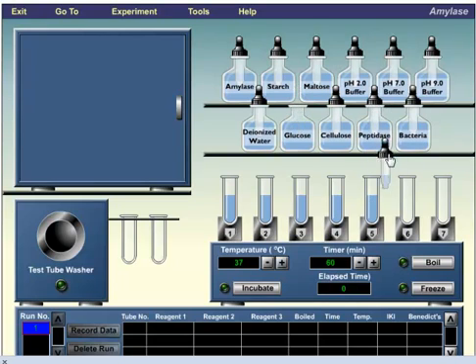In the other one, let's add glucose, water, and pH seven. And let's add to this one water and pH seven. What you should do is conduct this experiment at pH two, then at pH seven, then at pH nine to see how pH affects the experiment.